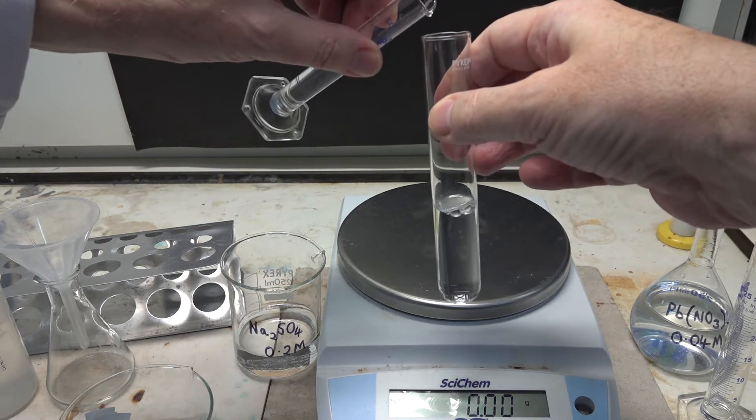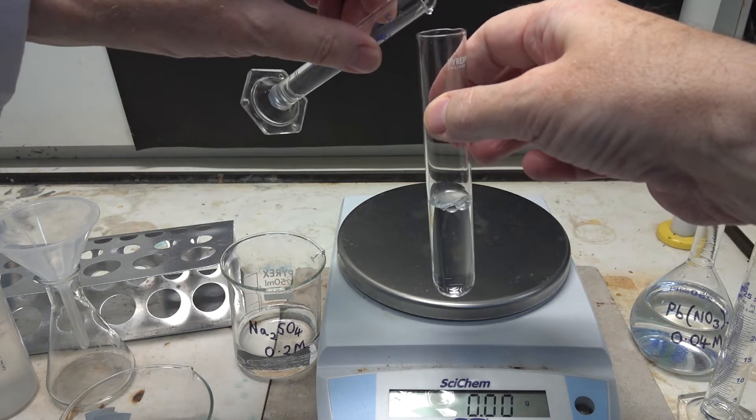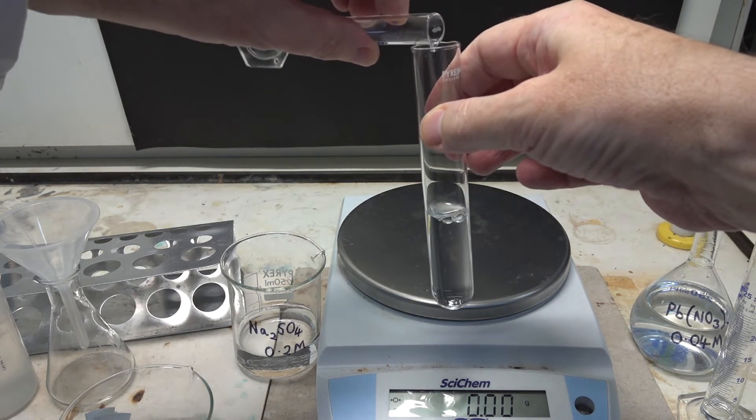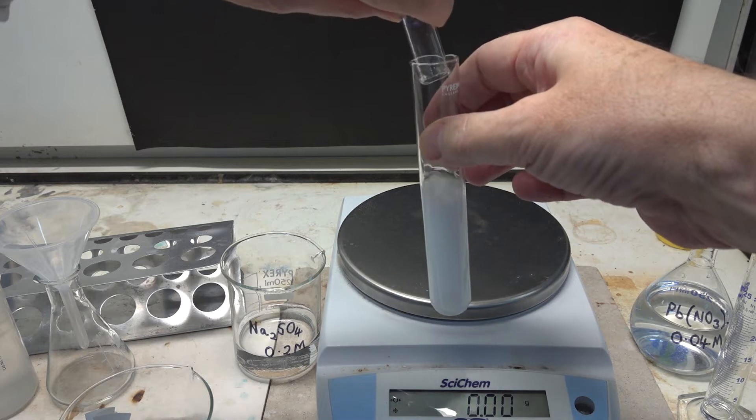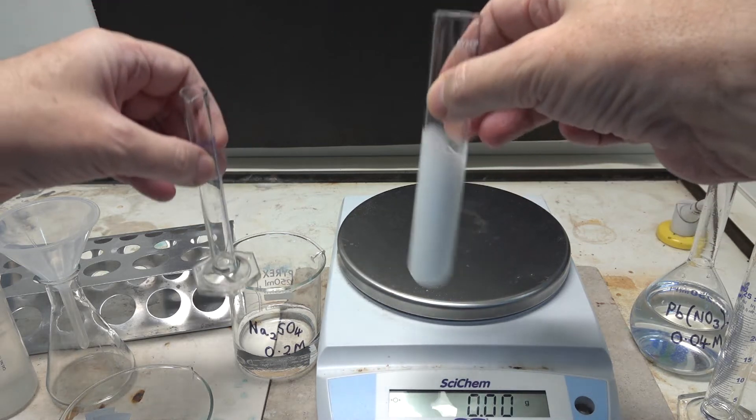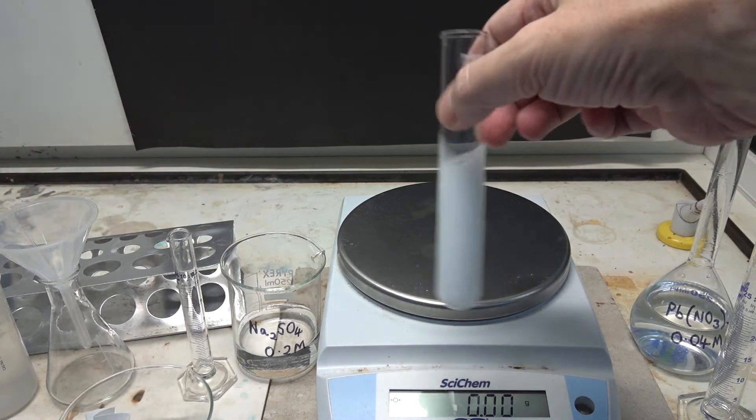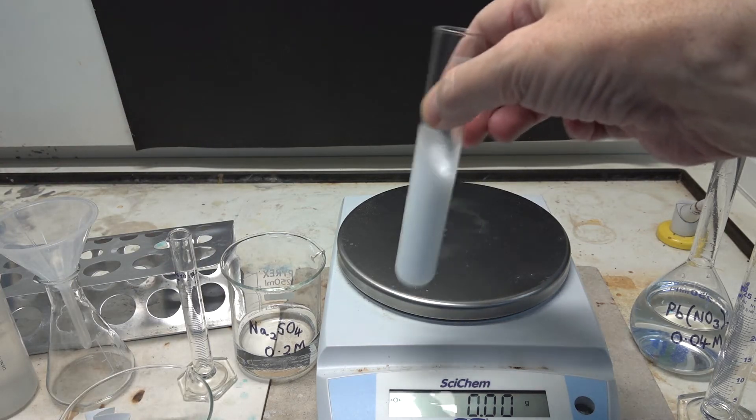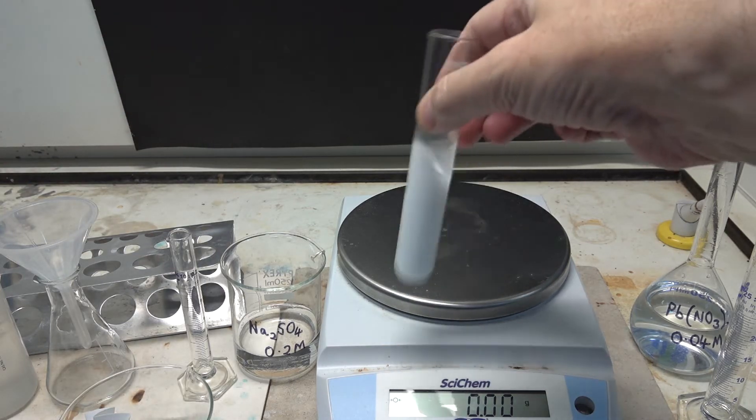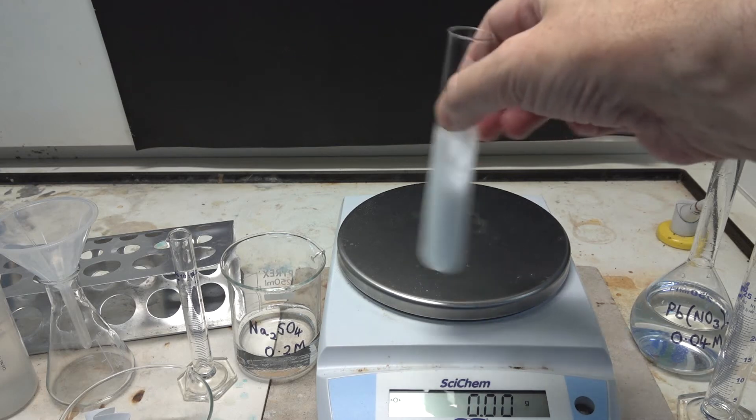So here's the reaction between sodium sulfate and lead 2 nitrate. As you can see, a white precipitate is immediately formed. We'll just give them a swirl to make sure that they're well reacted together there.